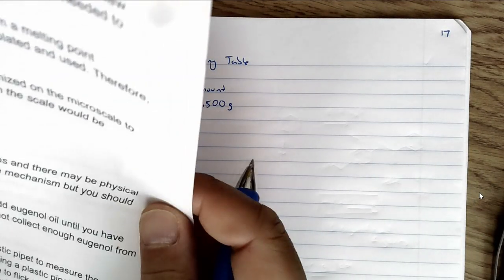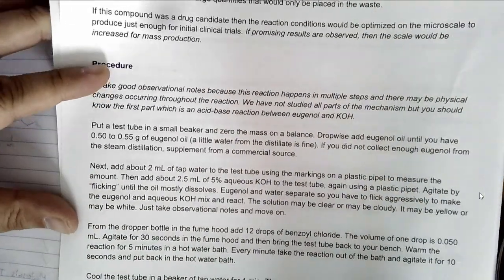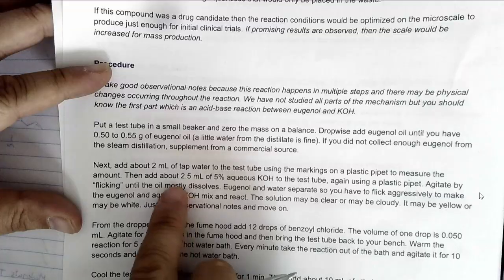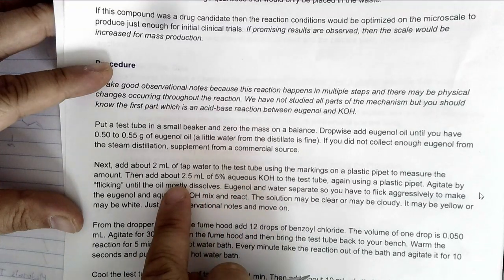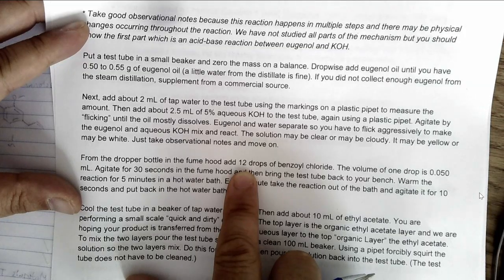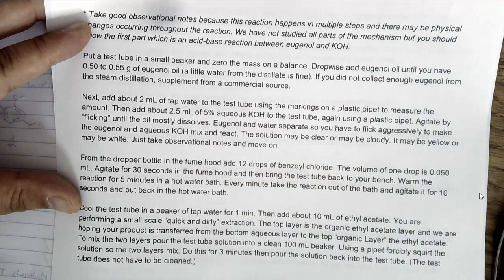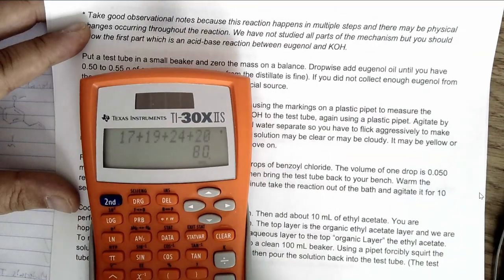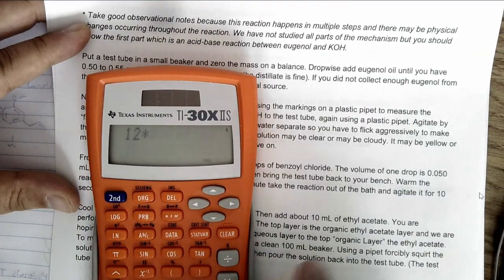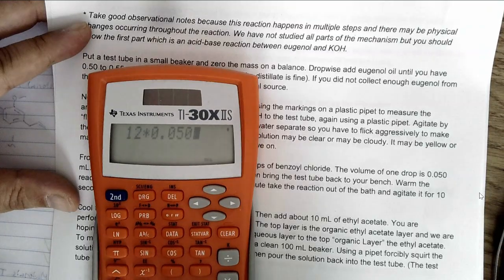Take a look at this one, it's a little bit tricky. The second starter material is a liquid, and it says here 12 drops. But I'm telling you 12 drops is that many milliliters. So go ahead and do the calculations. 12 times 0.050 milliliters.